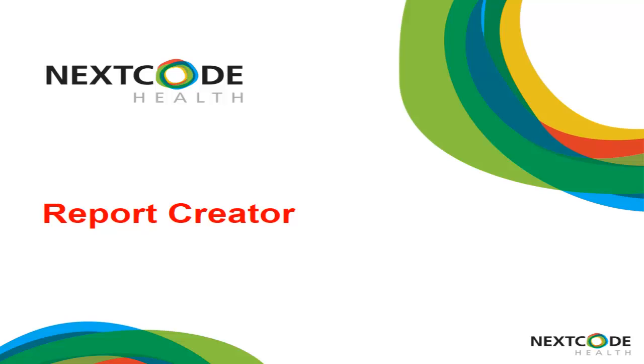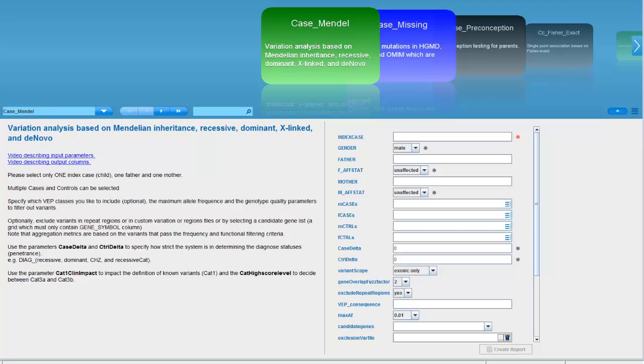Welcome to a demonstration of the Report Creator from Nextcode Health. The Report Creator is a feature of the Sequence Miner, wherein it is very easy to insert your subjects into predefined GOR reports that cover a broad spectrum of analyses in the context of next-generation sequencing.